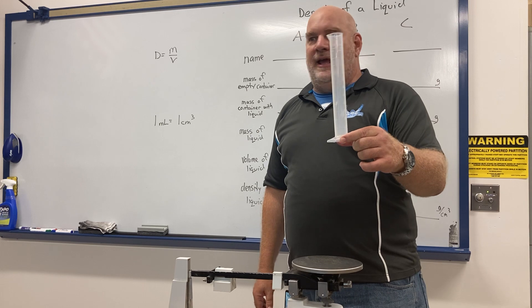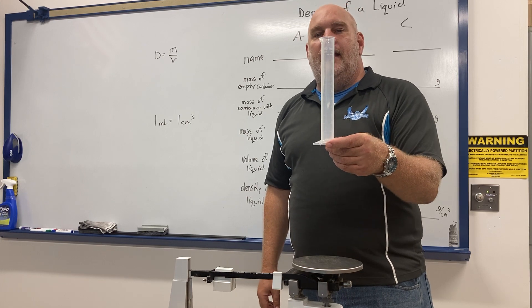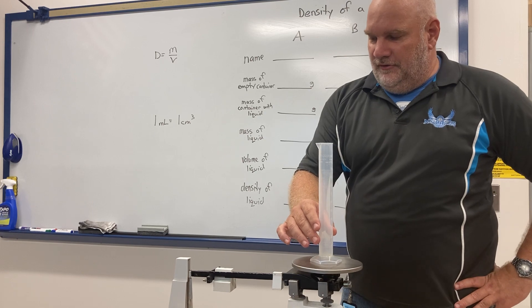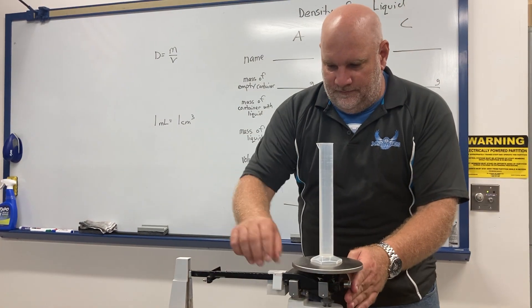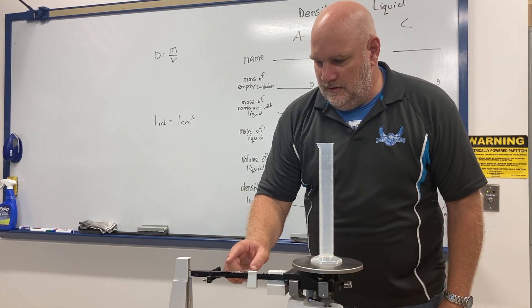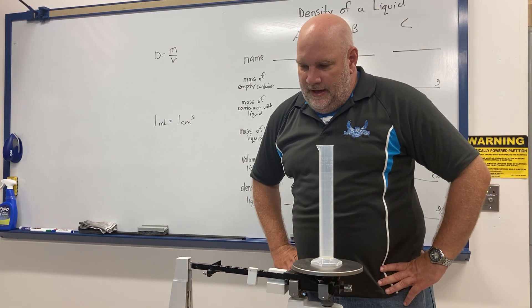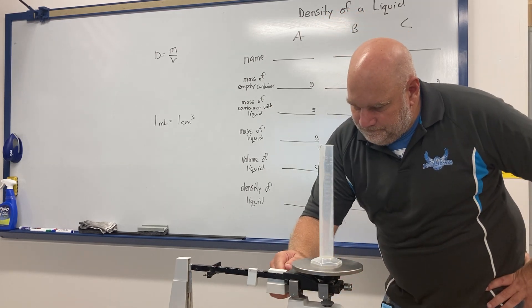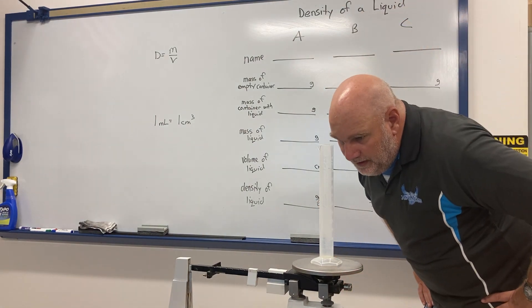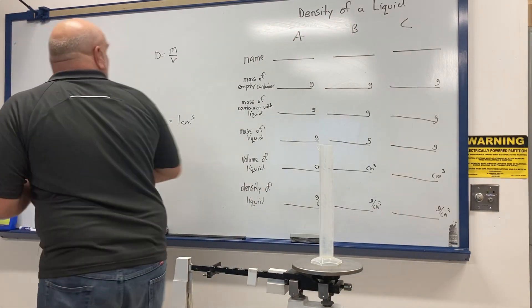I'm going to kill two birds with one stone — I'll measure the volume with the graduated cylinder and also find the mass of the empty graduated cylinder at the same time. I put the graduated cylinder on the balance and find the mass of the empty graduated cylinder is 41.9 grams.